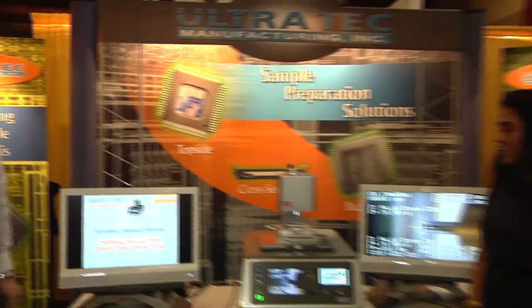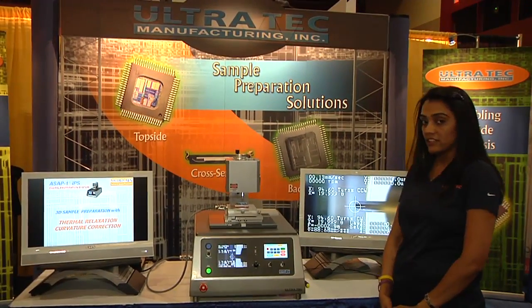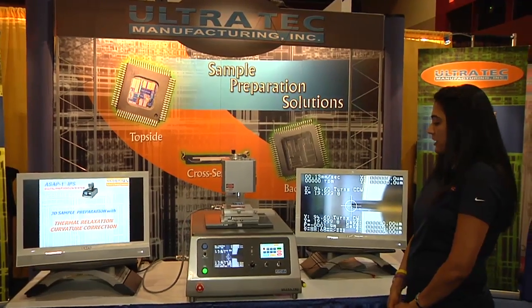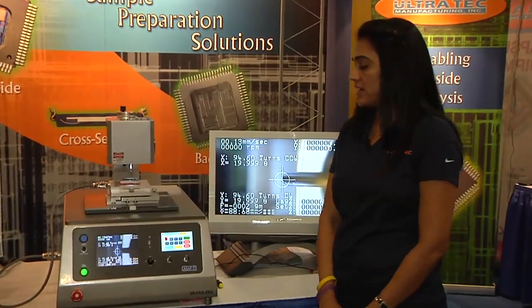Welcome to ISTFA 2012. We're here on the expo floor at the Ultratech booth where Hino Patel is going to tell us about this fine piece of equipment. My name is Hino Patel. I'm the Applications Engineer with Ultratech Manufacturing, and today I will be talking about our product ASAP IPS.